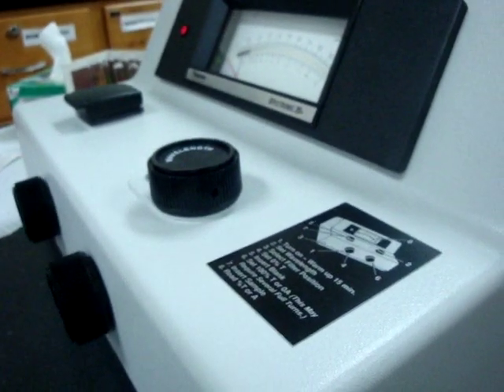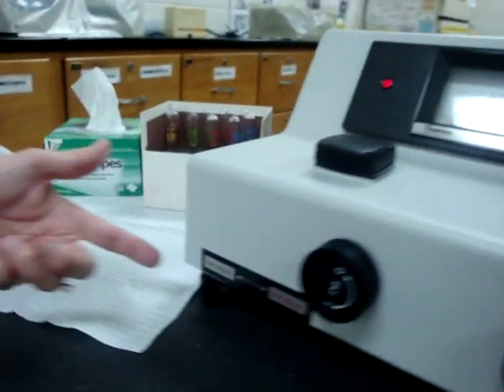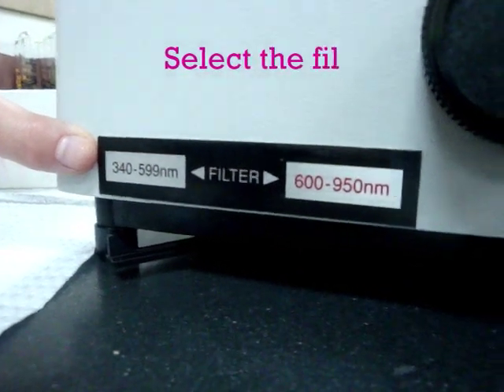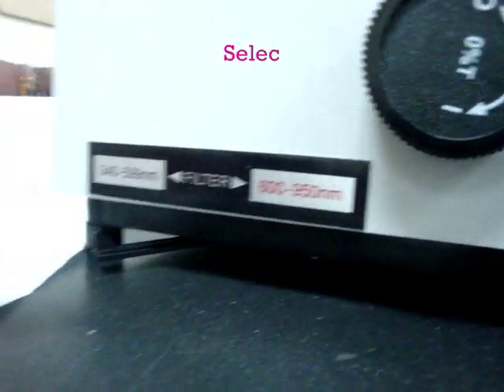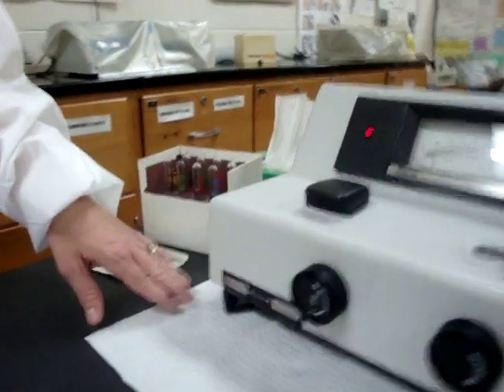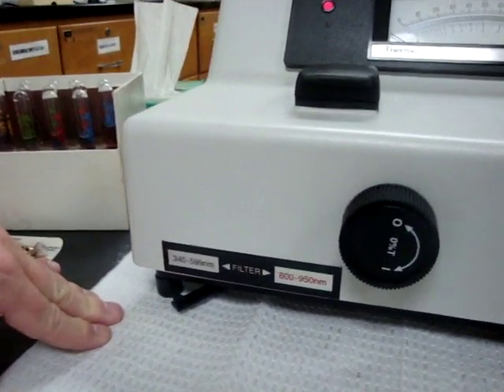The next thing is to select the filter position. On the Spectronic 20 Plus, the filter is on the bottom left-hand side. You have a filter for 340 to 599nm or 600 to 950nm. Since we're working at 420nm, it's already set correctly. Once the filter is at the proper position, move to the next step.